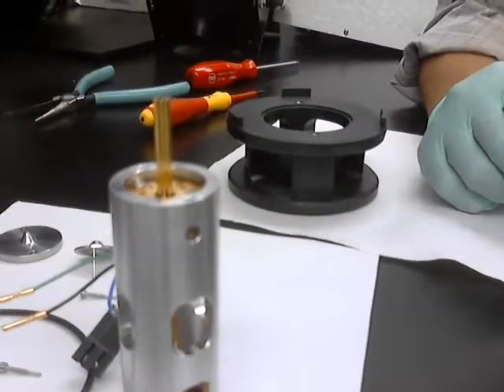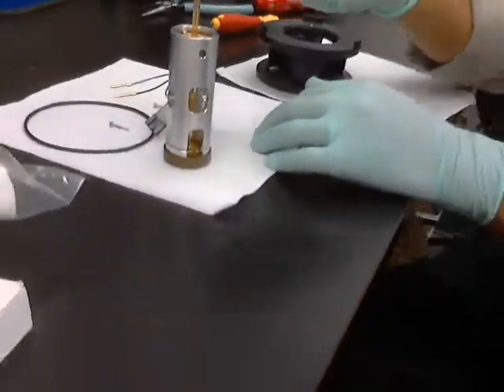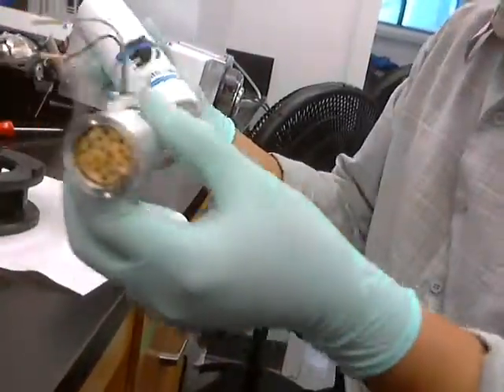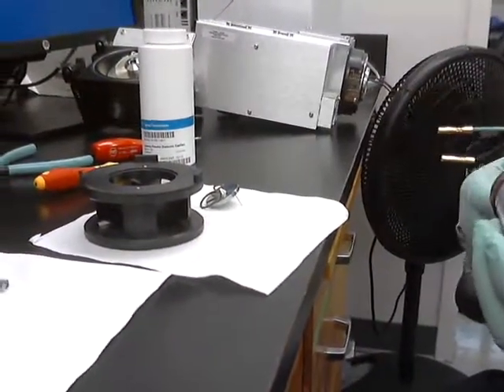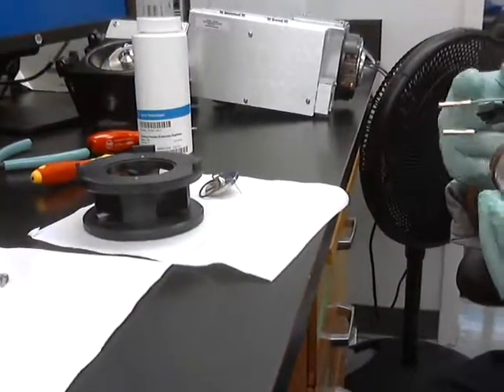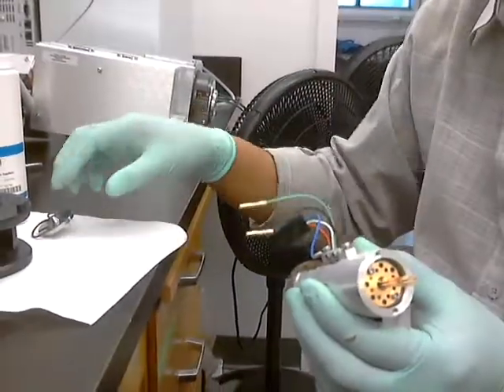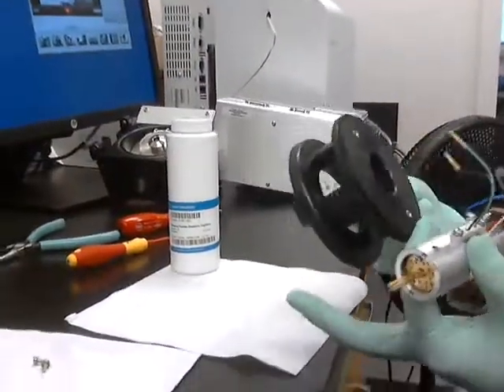So we'll clean these two and clean this one, and this one too. I'll use Alkanax and then wash these off with solvents — IPA first, and then methanol. Then blow it off really good with nitrogen. Same with this — we'll clean this one too with solvents. I'll take this off.